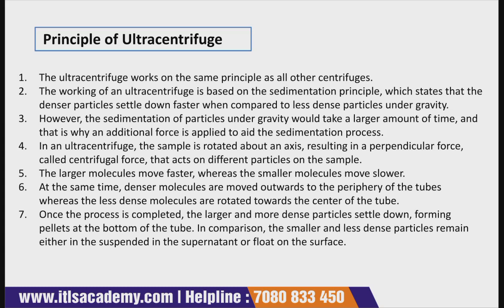The ultracentrifuge works on the same principle as other centrifuges. There is nothing different.